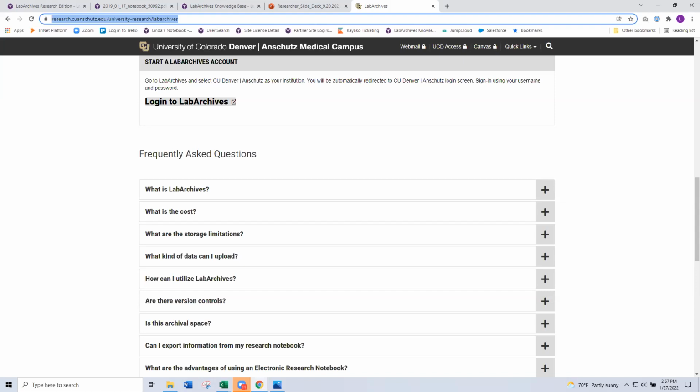Are there any programs that do not work in adding files into the notebook? No. Any file format can go into LabArchives. Your only restriction is up to 4 GB per attachment. Now, there could be cases, Christy, where you don't want to upload the file, you want to link to the file. So if it has some sort of a persistent URL, you might do that if it's on another online resource, for example.